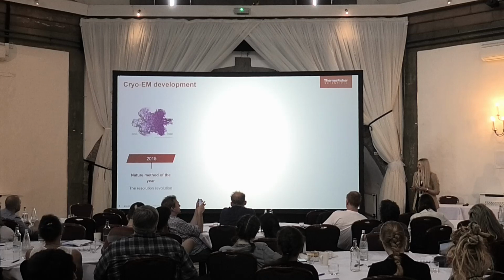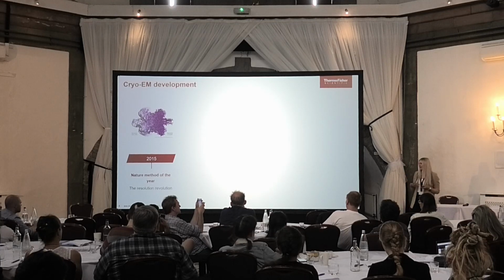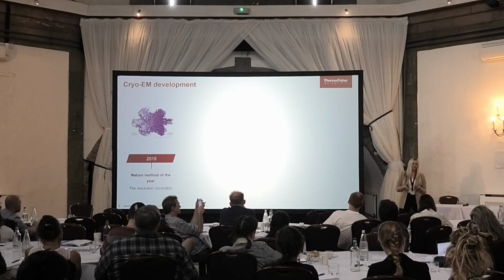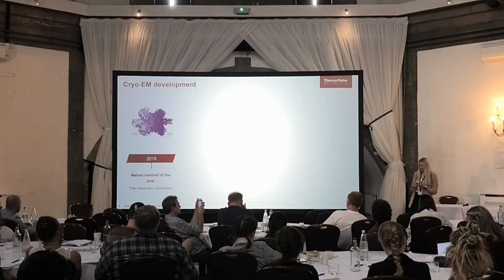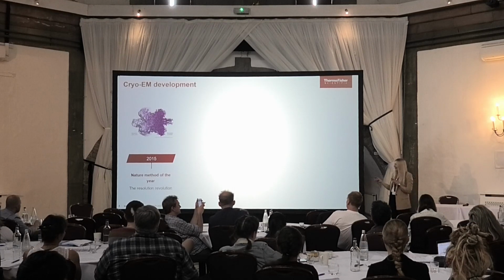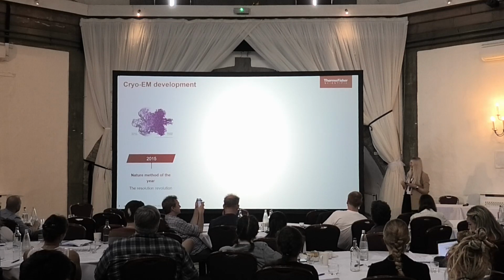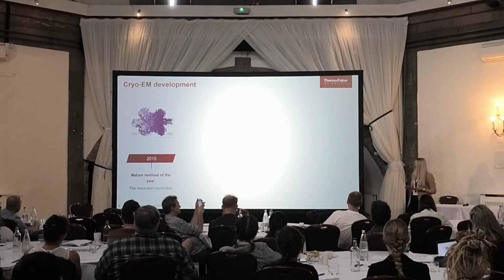So if we just start at the beginning of the resolution revolution, this was the advent of direct electron detectors alongside some other innovations in hardware and software, and that led us to go from blobology to high-resolution structures. And we also saw cryo-EM being named the Nature Method of the Year 2015.